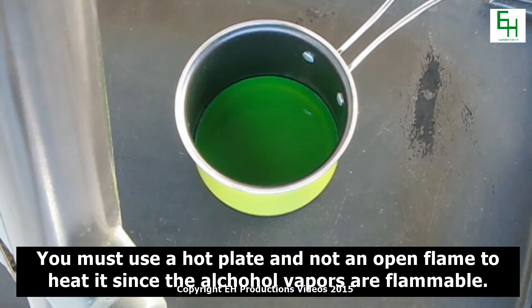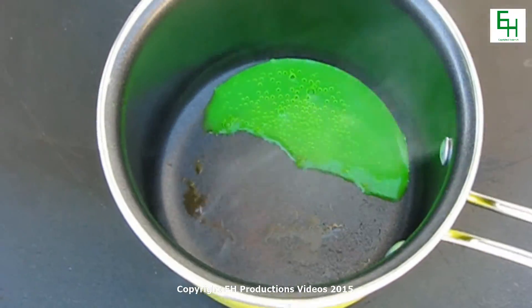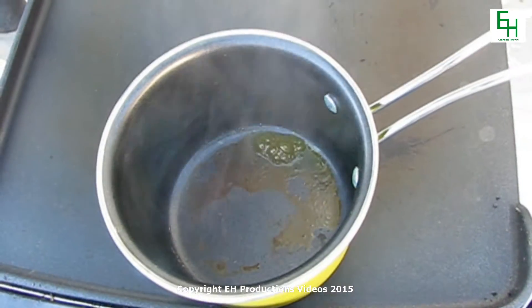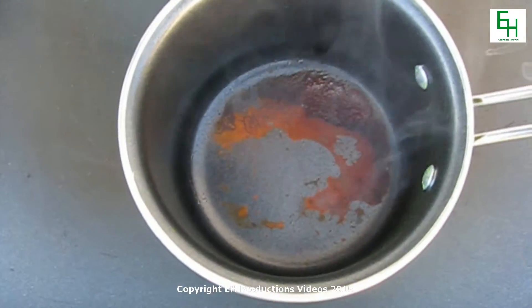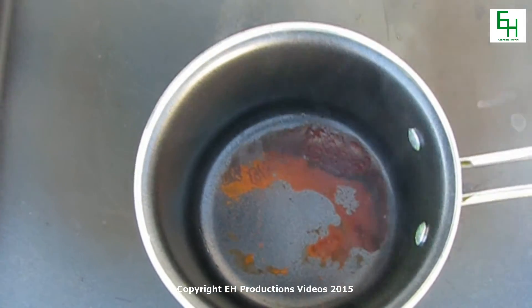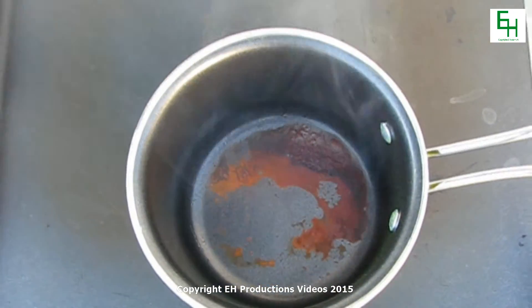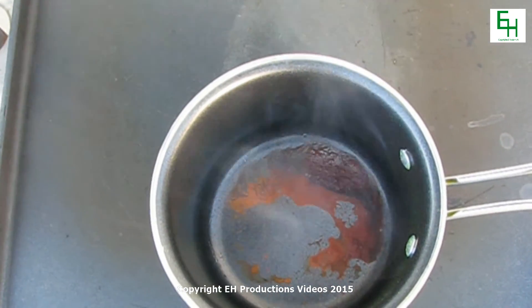As you can see right now on one side there is a lot of reddish powder. That reddish powder is the fluorescein that we're looking for. When it looks like this, that means it's ready to turn off the heat and just set this pot aside to cool. You can see the red fluorescein on the bottom of the pot. We're going to try to dry it up as best we can, but we can't completely dry it because it's hygroscopic — so it absorbs water from the air.